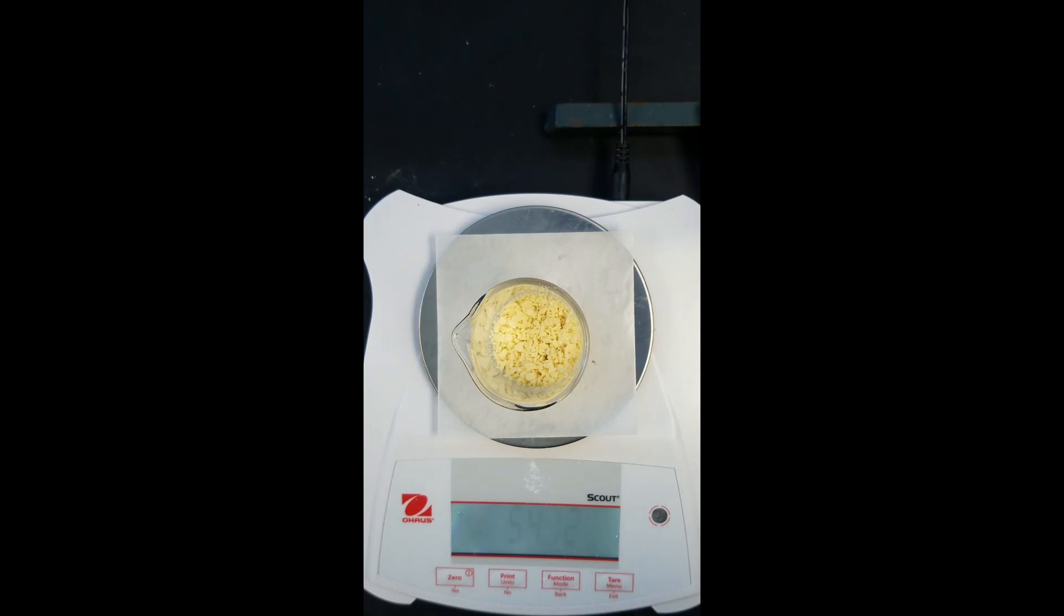We're going to follow the exact same procedure that we did with the first set where we add the 10 milliliters of petroleum ether, mix it for a minute, filter it and let the vacuum run for a minute. And we're going to do that three times in order to extract the fat from our Pringles.